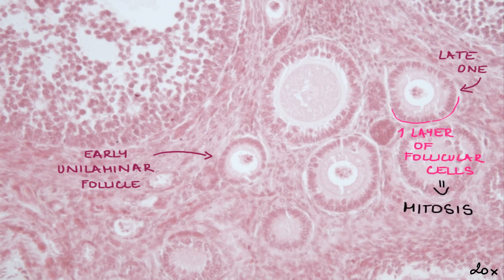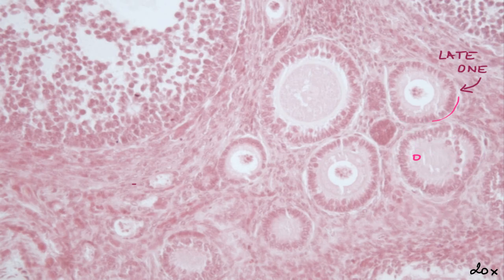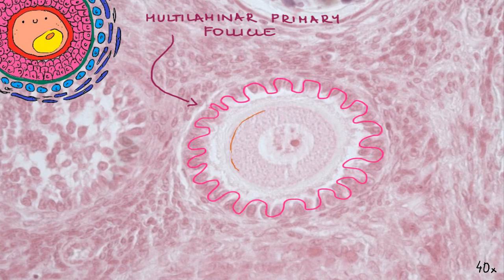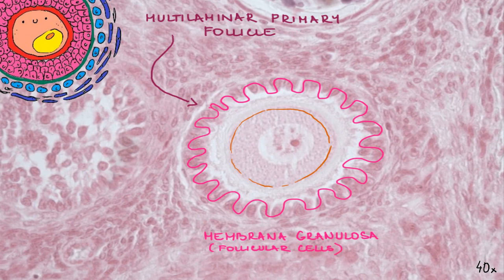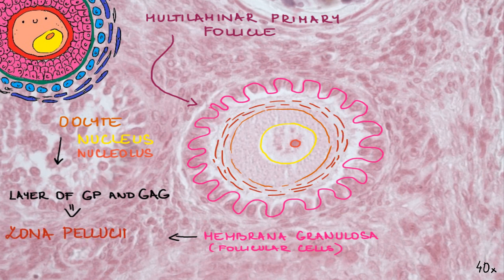Follicular cells divide mitotically, forming layers, and the follicle becomes a multilaminar primary follicle. The stratified epithelium around the oocyte is called the membrana granulosa; follicular cells can be called granulosa cells in more matured follicles. There is a nucleus and nucleolus clearly visible in the oocyte. Follicular cells produce a layer of glycoproteins and glycosaminoglycans which separates the oocyte and the follicular cells, called the zona pellucida. Both follicular cells and the oocyte's microvilli are in direct contact with the zona pellucida.